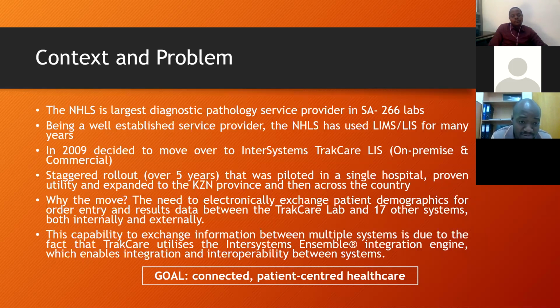So in 2009, that's when we moved from the previous system to the current system. I'll just highlight how we went about the rollout, and also why we decided to move to that LIS and the advantages that come with it.